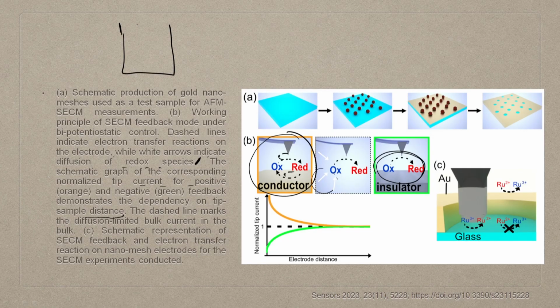Otherwise, if I look at a normal electrochemical setup, it will be something like this. Say for example, this is your working electrode WE, this is your counter electrode CE, and here is your reference electrode, which is RE. And of course, in the working electrode you have your compound and you measure it, but you have no idea how this compound is really distributed.